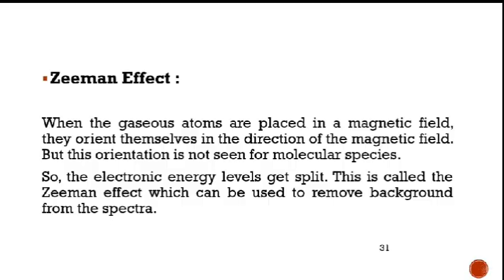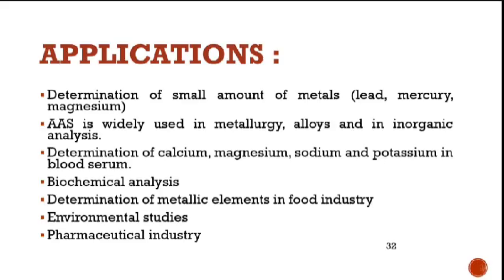Applications: determination of small amounts of metals such as lead, mercury, and magnesium. It is widely used in metallurgy, alloys, and in inorganic analysis. Determination of calcium, magnesium, sodium, and potassium in blood serum. Biochemical analysis. Determination of metallic elements in food and industry. Environmental studies and the pharmaceutical industry.